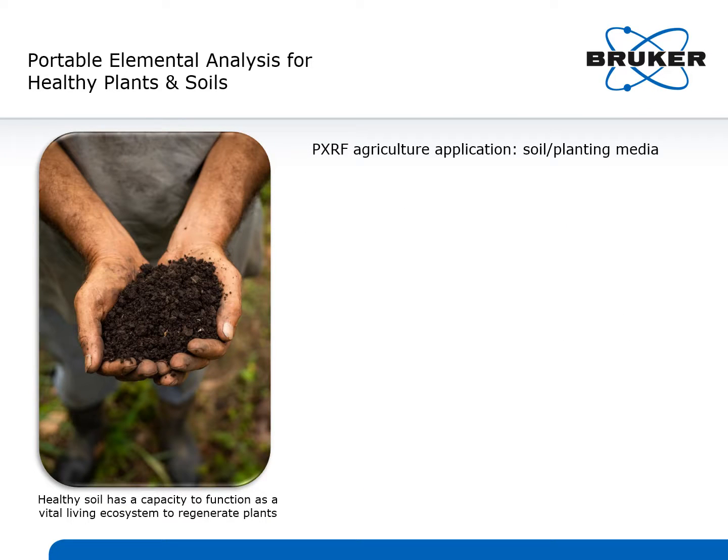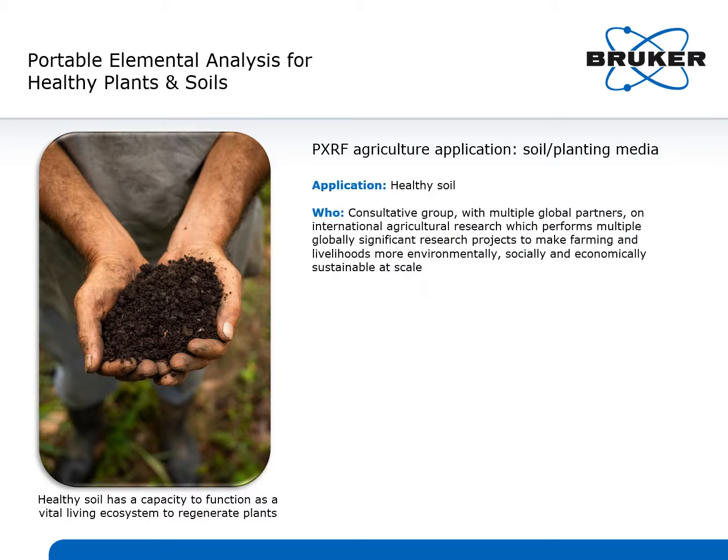Healthy soil is important to hold roots and store minerals, metals, and water. A consultative group in Kenya with multiple global partners operates a network of soil plant spectral diagnostic laboratories around the world. One of the first things they participated in was the development of soil nutrient maps throughout Africa to improve the regenerative agriculture potential of smallholder farms.